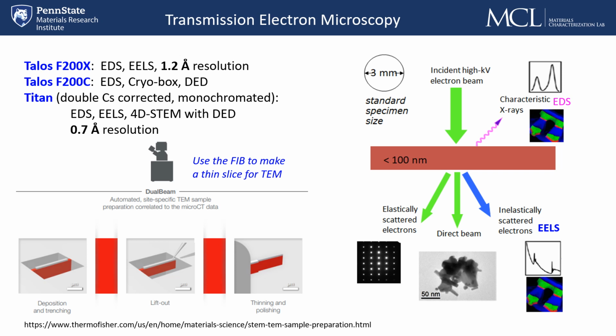Then we're going to put it in the microscope, and there's a bunch of different information we can get out of the TEM. But again, the types of information we're getting is at the nanometer level or all the way down to the angstrom level. So when that beam goes through the sample, it's going to be scattered by the material, and you can have elastic scattering, which is going to give you a diffraction pattern, and it's going to tell you what crystal structure your sample is. Then the other type of scattering would be from mass scattering or thickness scattering, and so that's going to give different contrast levels based on thicker regions might be dark, or regions that have heavier elements present there would also be darker, so we get mass contrast.